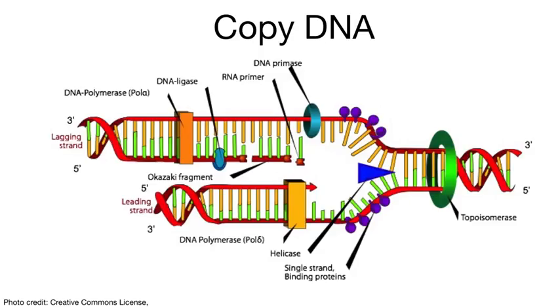Polymerase chain reaction, or PCR, mimics how DNA is copied in nature. So let's talk about what happens in nature first. To copy itself, DNA first has to unwind. An enzyme called DNA helicase does this. It basically looks like a zipper unzipping the DNA.